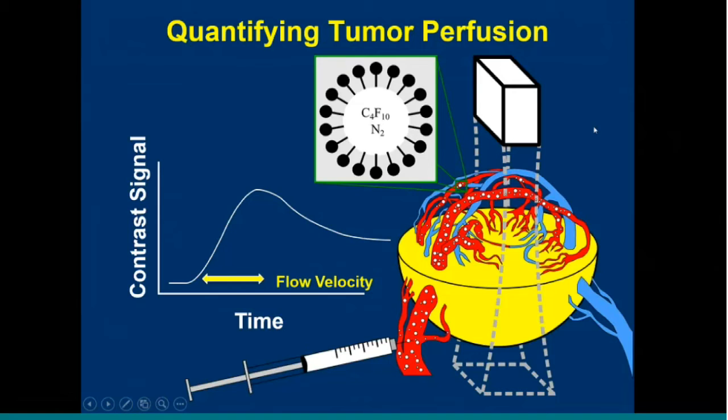During my mouse studies, we've typically done the recommendation of 700 microliters per vial of contrast agent. For the CAM, we've had good results with diluting that down to about 1,000 microliters per vial. And at 50 microliters of contrast agent per animal, that if you're perfect with your injections, is going to be about 19, 20 animals or so with some waste per injection and so forth. If you're not great at the injections like I am, I'm kind of middling at it, that's closer to about 15 animals. So you can still get a pretty good data set per vial in that case, even if you're not the best at the injections.